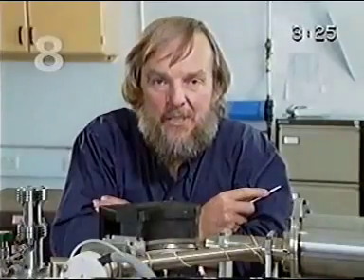To provide information about the isotopic composition of any sample, such as a mineral, a silicate or an oxide, we have to ensure that the oxygen is transferred to the gas phase. Sample preparation is of paramount importance because we have to make sure that all the oxygen is obtained and that no fractionation, that's artificially changing the isotopic composition, is introduced during the experiment.